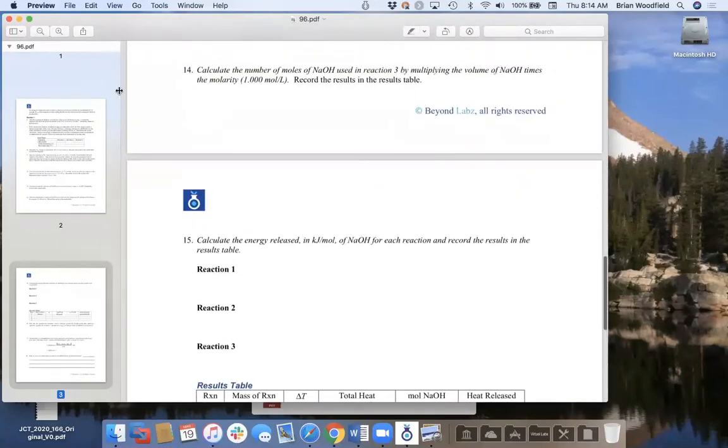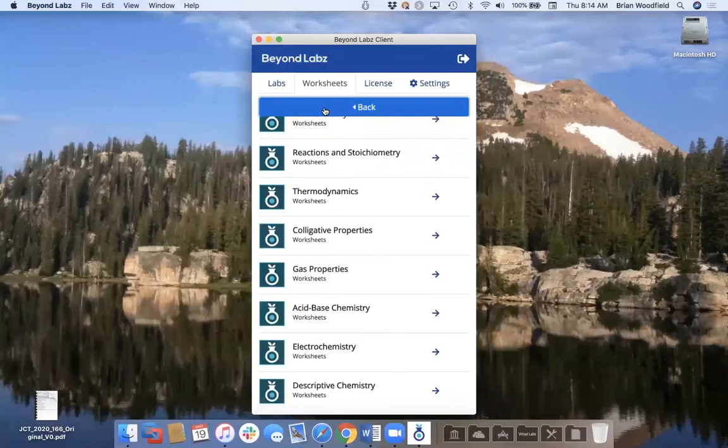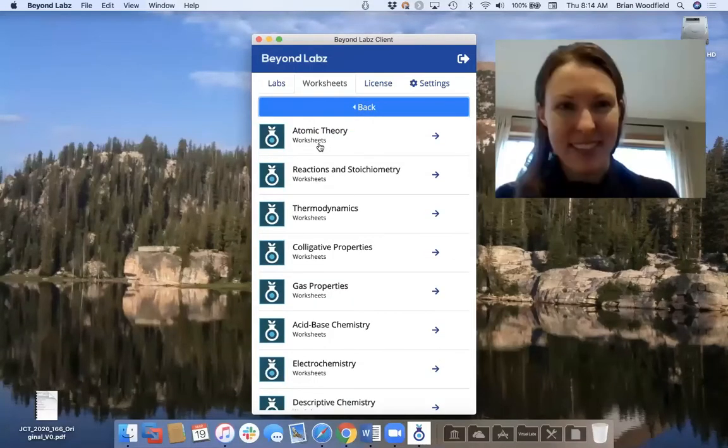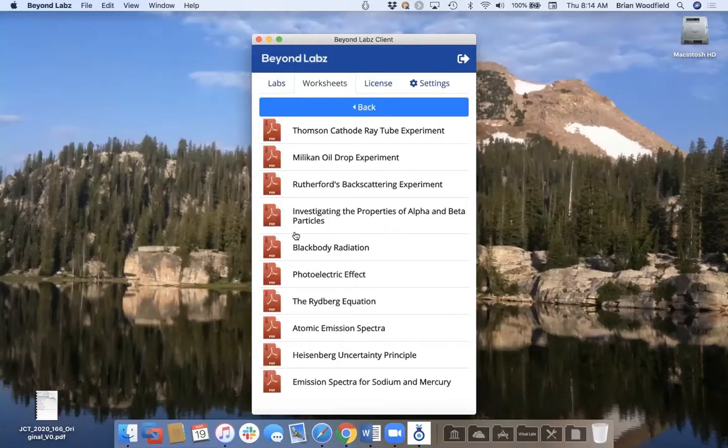This is just one example, and we have about 80 lab activities. But you don't have to use the lab activities unless you want to. These are just there for you to use, and you choose the ones you want to use. There's no question we have much more content than what you may use. In my experience, how we teach chemistry is highly unique from instructor to instructor, in what they think is important. So we try to be pretty broad in what we have here.